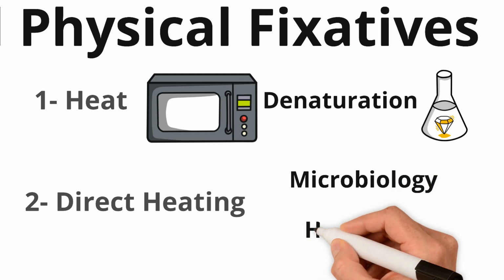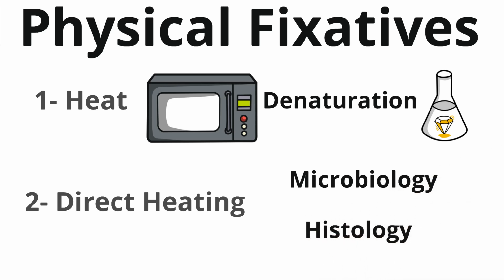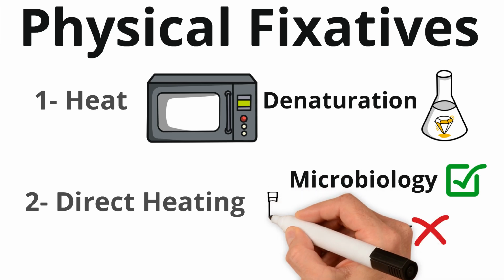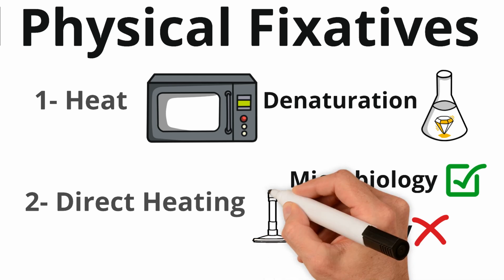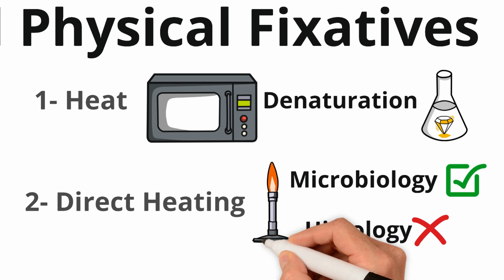But when you take your microbiology lab class and you're playing around with bacteria, they have you prepare a bacterial smear by briefly passing the slide through a flame. This process kills the bacteria and denatures their proteins, effectively fixing the cells to the slide for staining and examination.